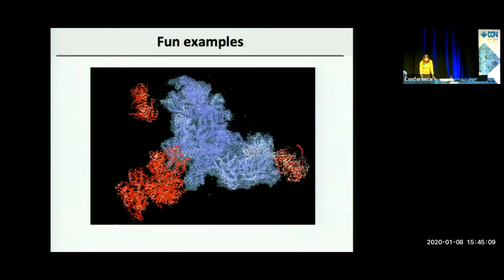And here's another example. Again we have a molecule, and the coloring here is according to the correlation coefficient between the map and the model. Blue means good, a positive correlation, and red means bad. Again, this surface shows the map. And now we immediately can see why there is such a bad correlation between the model and the map, because here we actually don't have any map. The map which has been deposited does not cover the entire associated model.